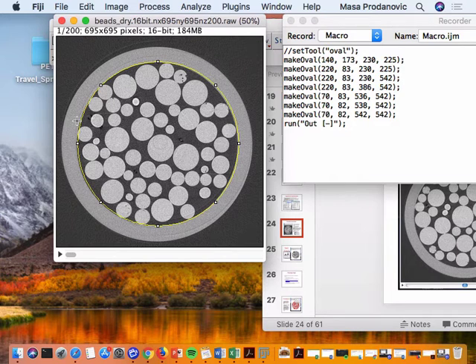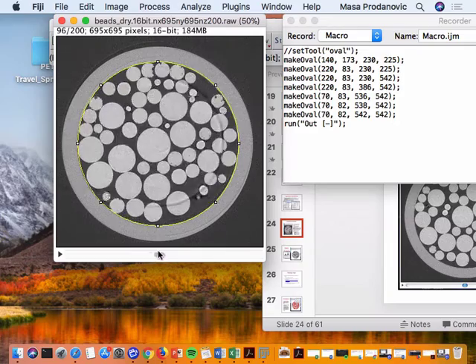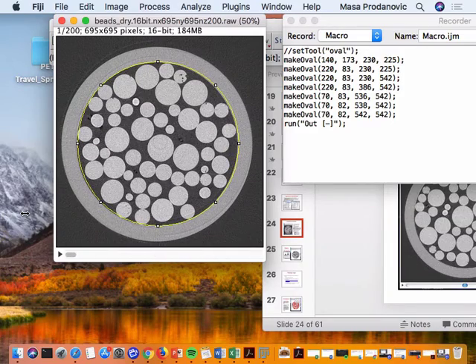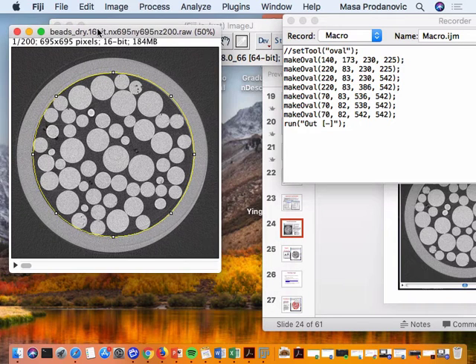And especially with the medical CT downstairs, you have a much larger object in the CT, so you might be slanted. Okay? So you will see that this circle kind of fits ever so slightly different in different slides. So you might want to go a little inward if you want to. That's now I'm going to leave up to you. For this particular exercise, it's not important, but it might be important for whatever you want to do with it. Okay?